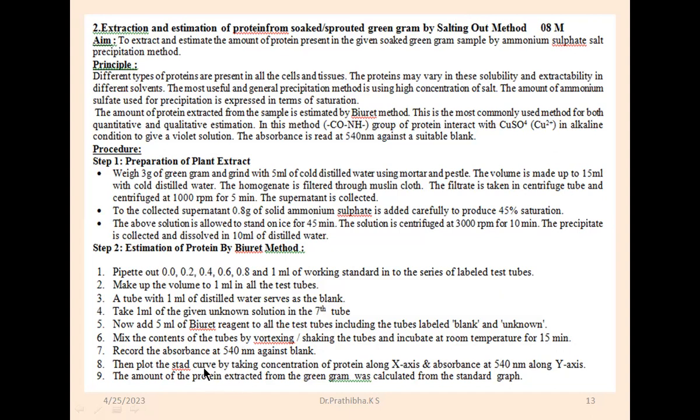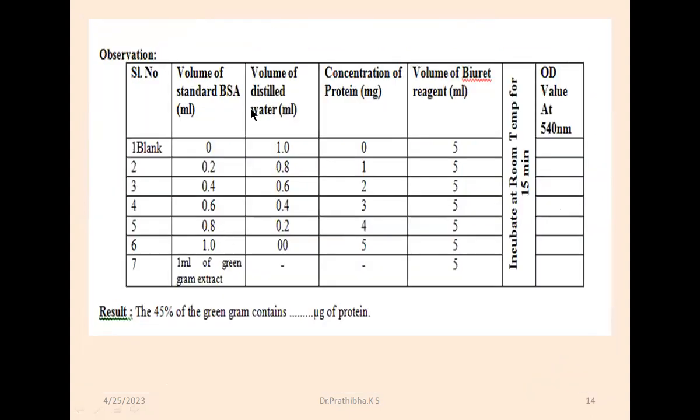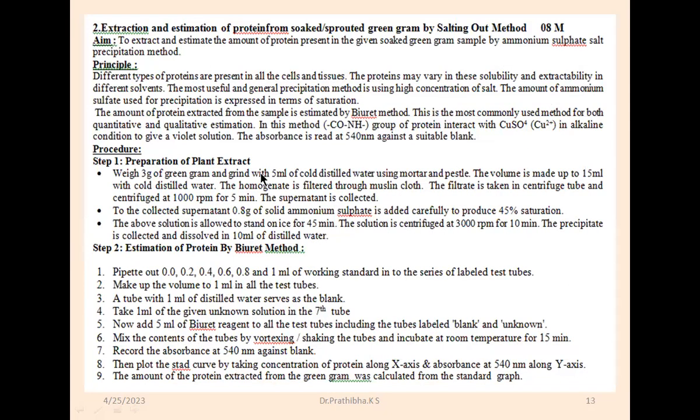This is the procedure in the form of a flowchart, okay, in sentence form, or you can also write this in the form of a tabular column. Okay, here you can see the biuret method. So I hope you are able to understand.